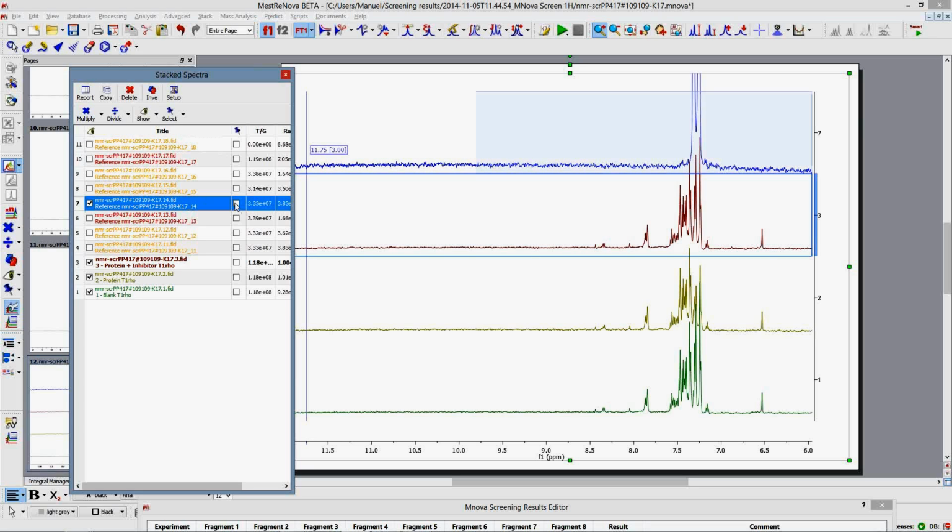That can be critical if you are making a visual inspection and you are not happy with one particular sample and you would like to just phase that sample and make a baseline correction on that sample. So bear that in mind. This will save you a ton of time.